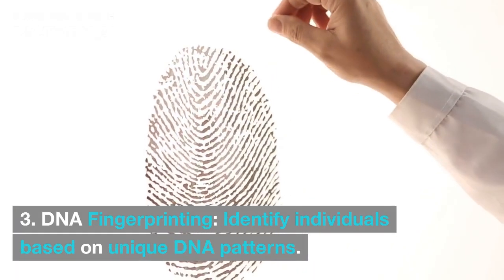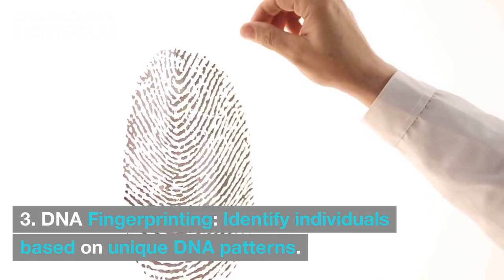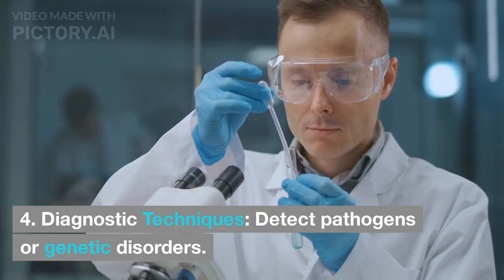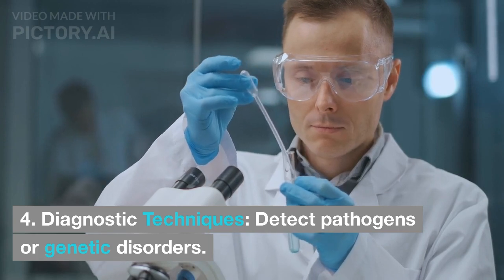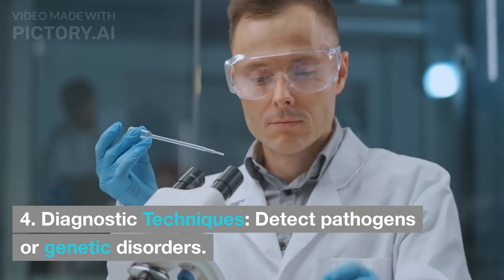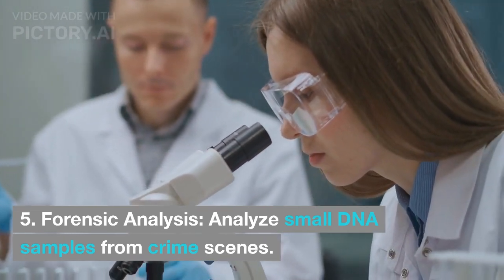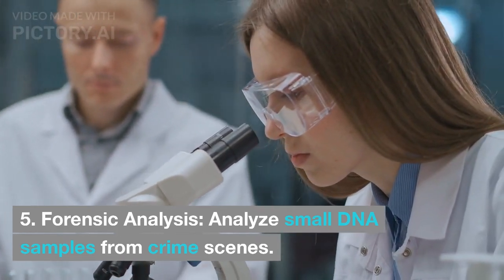DNA fingerprinting. Identify individuals based on unique DNA patterns. Diagnostic techniques. Detect pathogens or genetic disorders. Forensic analysis. Analyze small DNA samples from crime scenes.